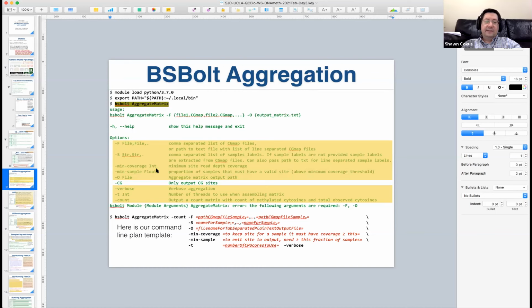And then, as we talked about on day one, when we do these analyses, we're now going to have to make a decision about what sites in the genome we're going to analyze. Not every site in the genome will have every sample with coverage, or with coverage in a range that we like. So we have to pass to a subset of sites in the genome that are going to be reasonably complete and of high enough coverage in enough libraries that we're going to be happy with analyzing.